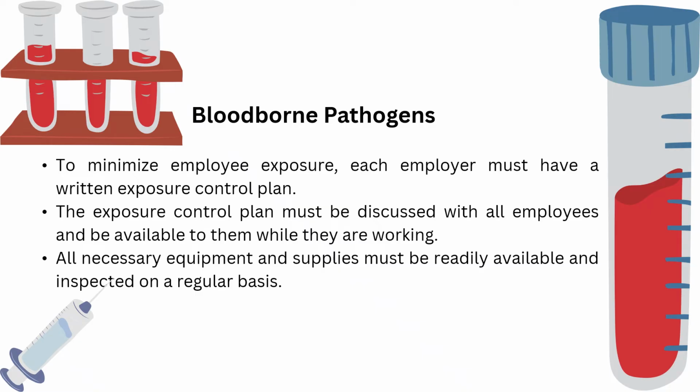they are working. The employee must be provided with adequate training in all techniques described in the exposure control plan at initial work assignment and annually thereafter. All necessary safety equipment and supplies must be readily available and inspected on a regular basis.